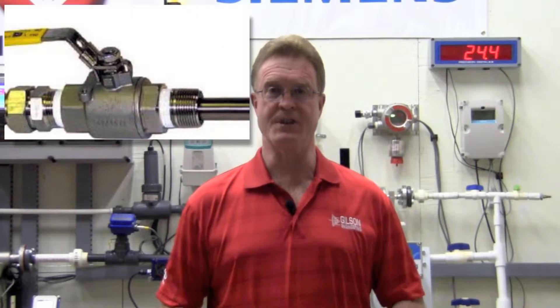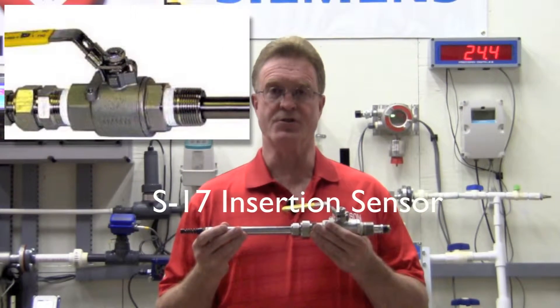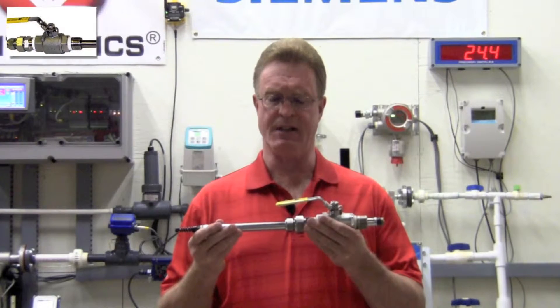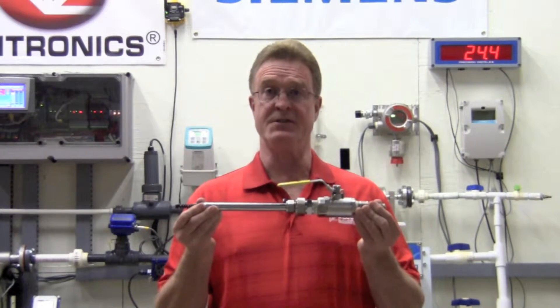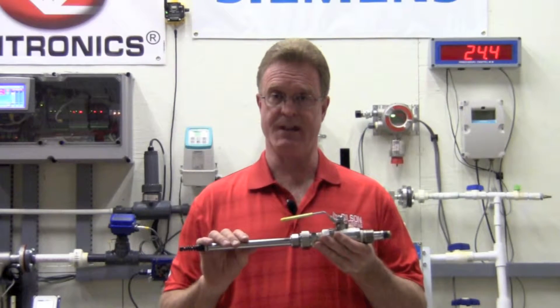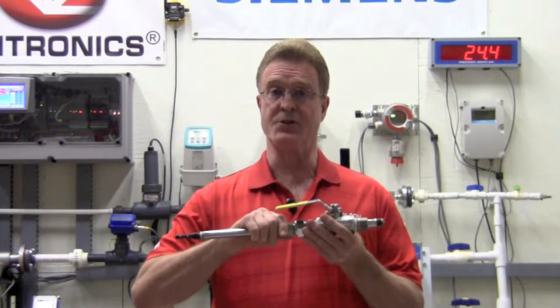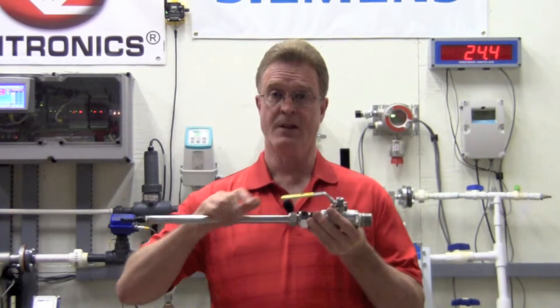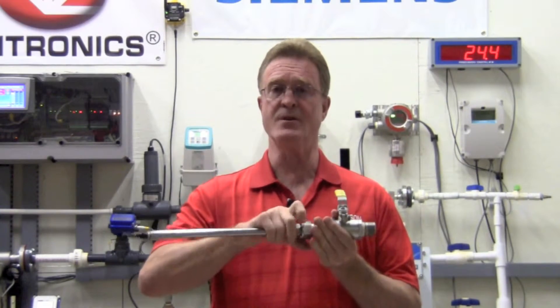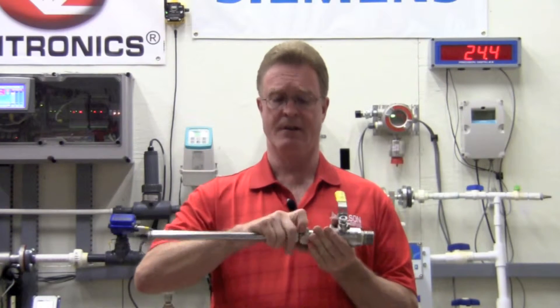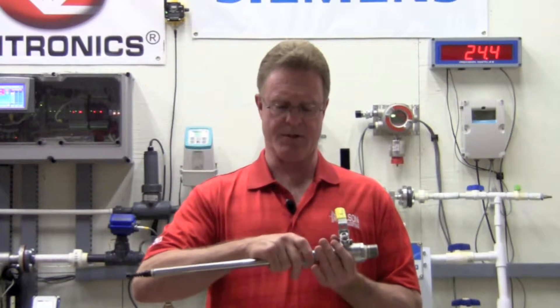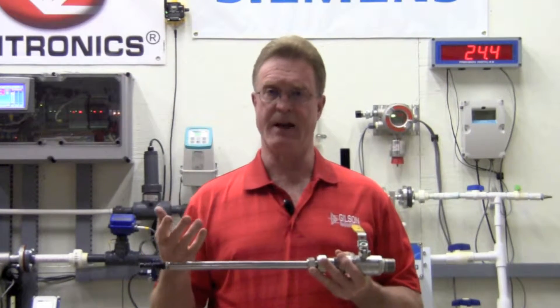The second style sensor offered from ECD is an insertable valve retraction probe. We have traditionally called this the S17. The S17 is made of a piece of stainless steel tubing, internally amplified in the electrode on the front, just the same as the S10. But with this assembly, we allow you to extract the sensor, shut a ball valve, sealing you off from the process, allowing you to remove the sensor, and accomplish your calibration. Reinsert the sensor, open the ball valve, and you're back in business.